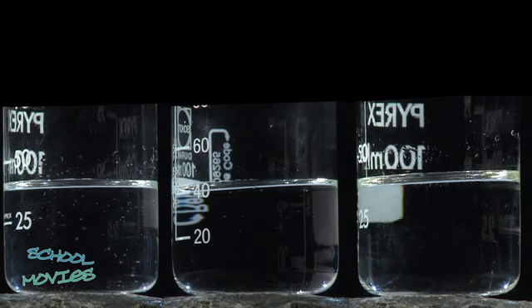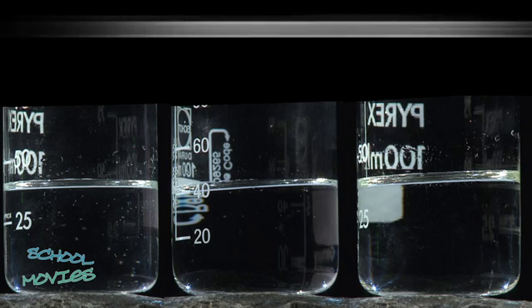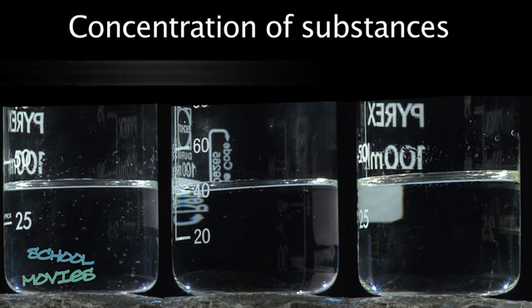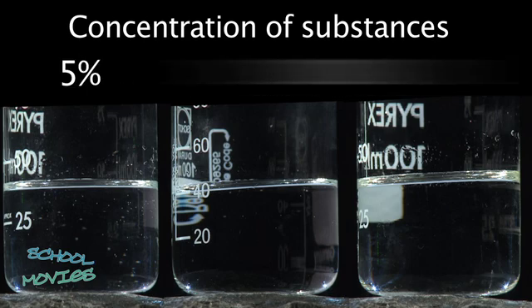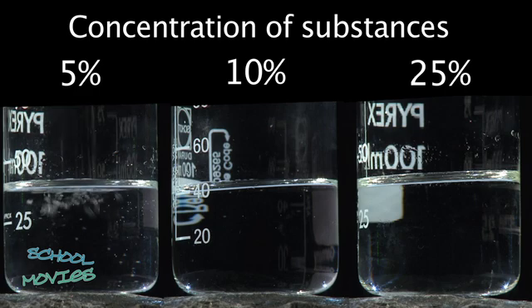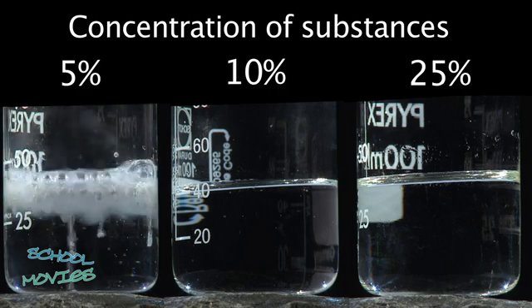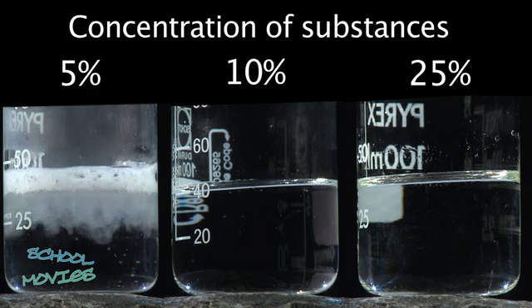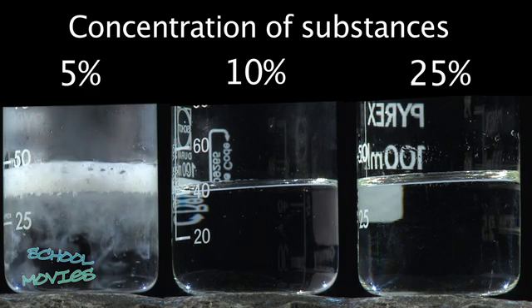Various factors determine how fast a reaction occurs. One of them is the concentration of the substances involved. How the concentration of the substances affects the rate of a reaction can be observed in the reaction of diluted hydrochloric acid with zinc. These three containers are filled with hydrochloric acid in different concentrations. Now the same amount of zinc is placed in each container. Initially, almost nothing is happening in the container with the least concentrated hydrochloric acid.